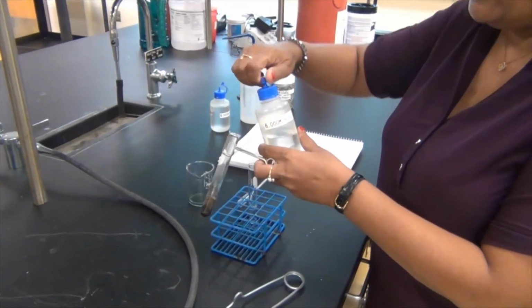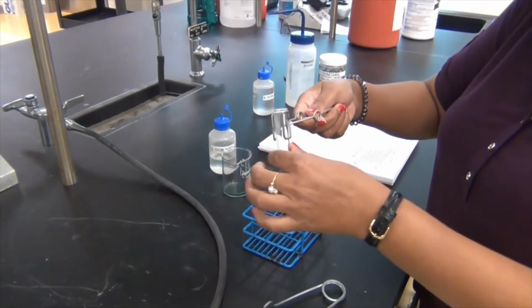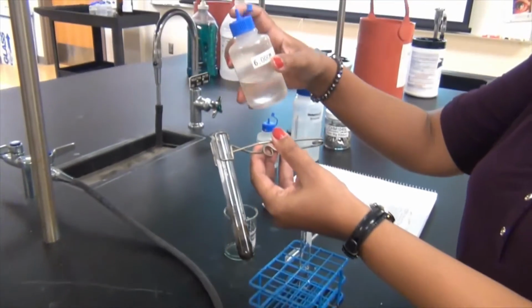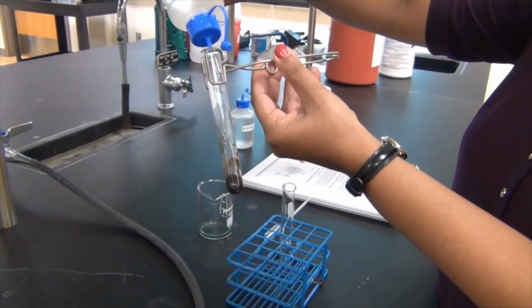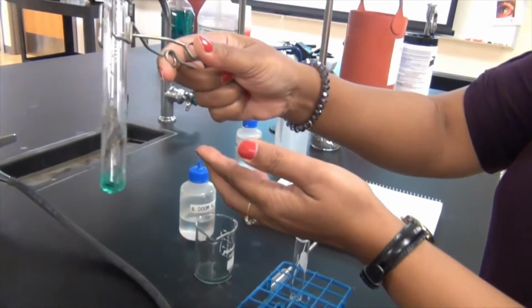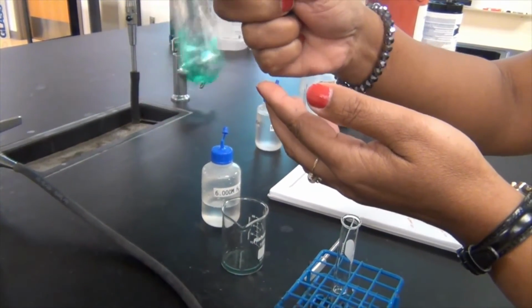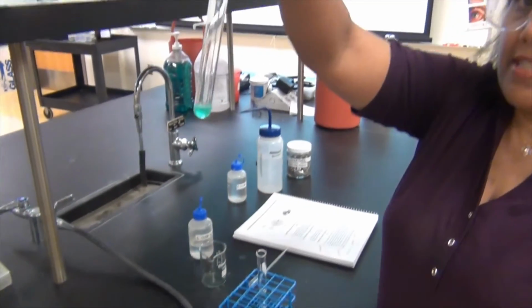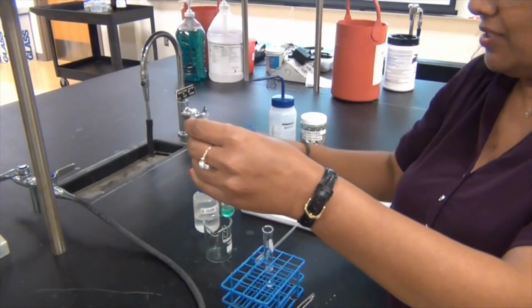In this lab, it is really important to make sure that you read the labels carefully, okay? So I'm going to go ahead, and I think the test tube is still warm. So adding the sulfuric acid now. And I can see that I still have some on the sides of the test tube, so, oh! Got it. It's safe. It's a save. That's why I was trying to get it out of the test tube holder. Okay, all right. It's a good save.